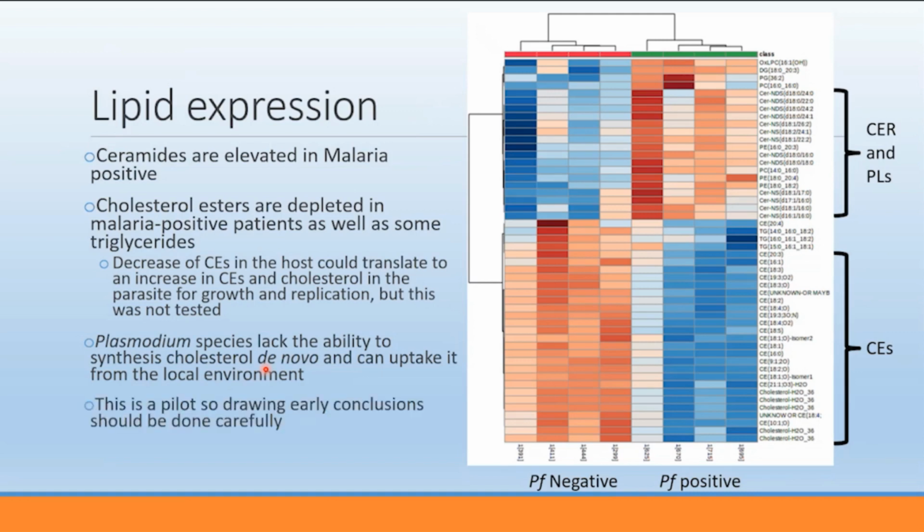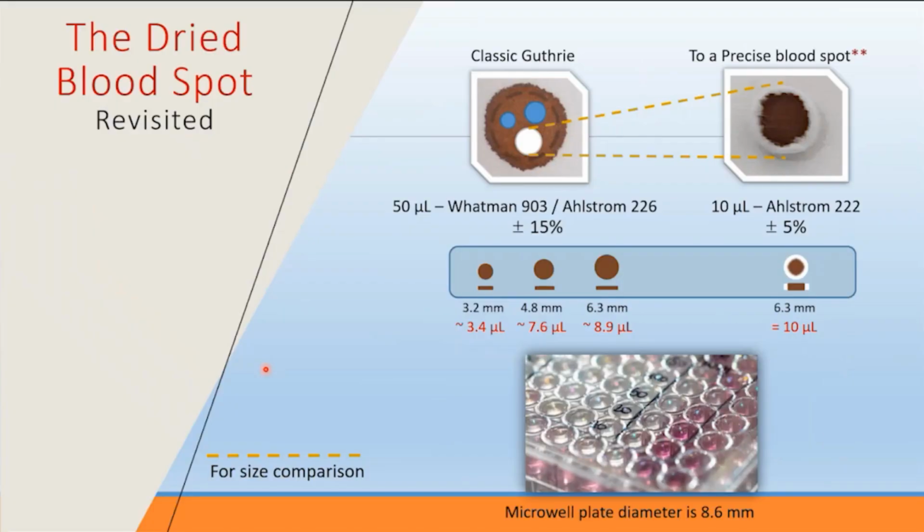And this is really just a pilot study, right? It's only 4 samples, a way for us to quickly test whether or not we can use old samples and whether they would be useful for doing biological interpretation. And yes, in this case, we do. And so now we're undertaking a much larger study with roughly 100 subjects and looking across different disease infections, both HIV and malaria, to try to understand more about what could be happening.